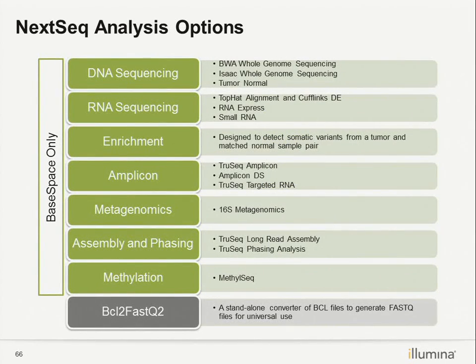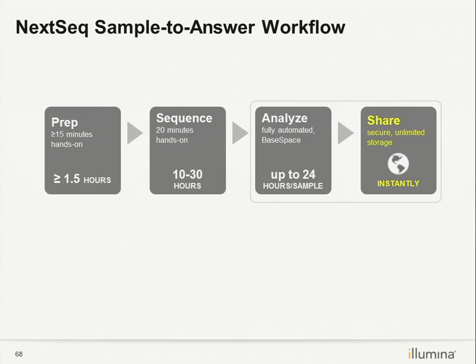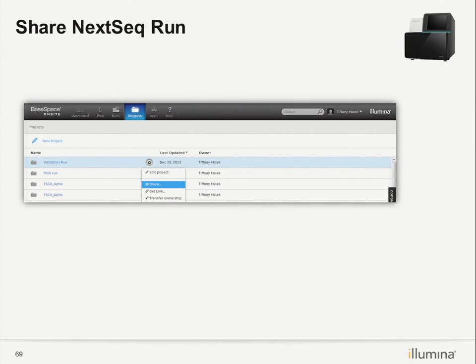Okay. And for analysis for different applications, we have different apps available in the base for analysis. I'll go through in detail in tomorrow's base session. So this is just a highlight summary. Okay, and library prep, I guess Aaron is going to touch more.